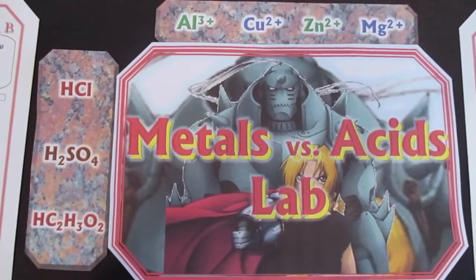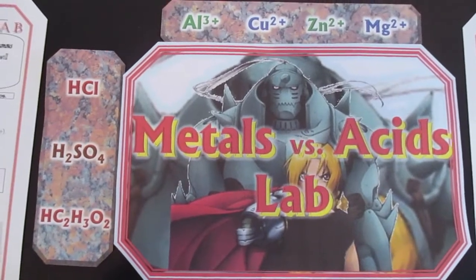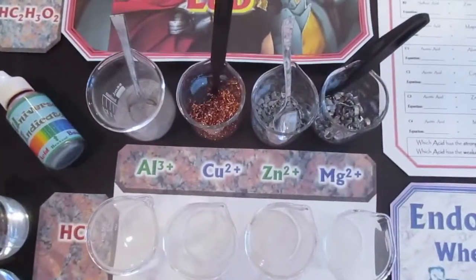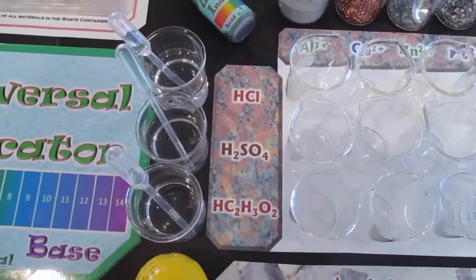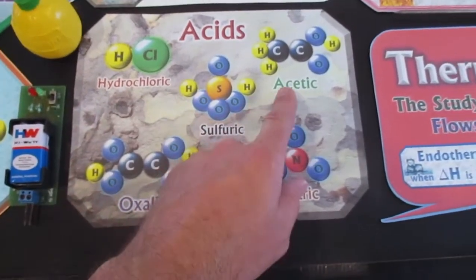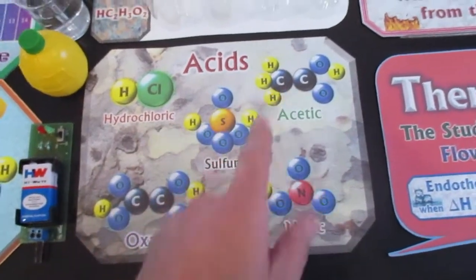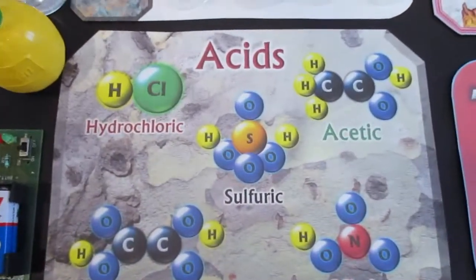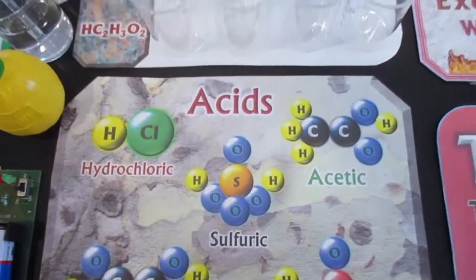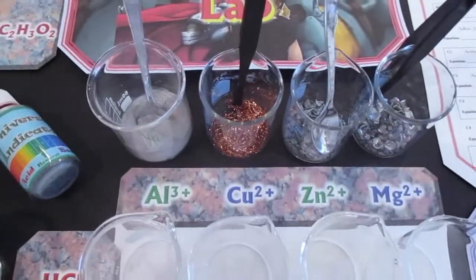The metals versus acids lab. We will be reacting several metals with several acids. If these are good acids, they should do exactly what they're supposed to do. And what are they supposed to do? Well, they're supposed to react with metals, aren't they?